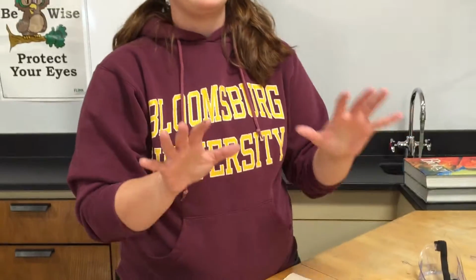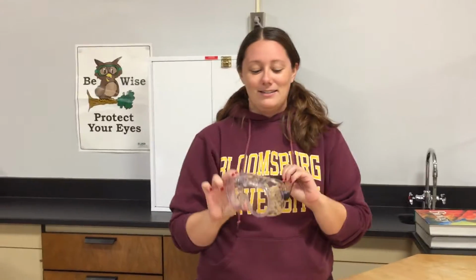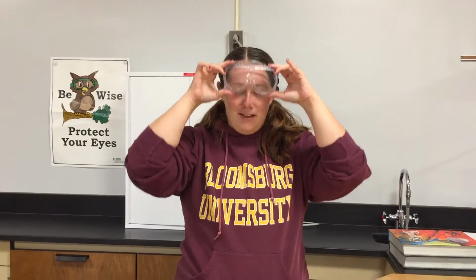But before we even get started touching liquid, we need to keep safety in mind. So we have these fabulous, cute, adorable, handsome, whatever you want to say, safety glasses. They look good on everybody. Safety glasses belong over your eyes. They do not belong up here.